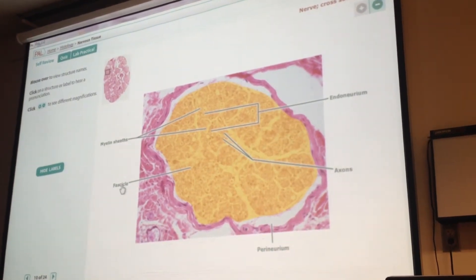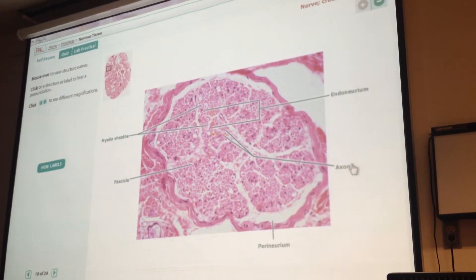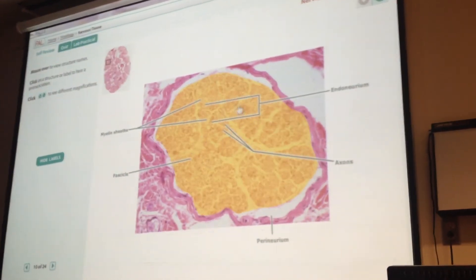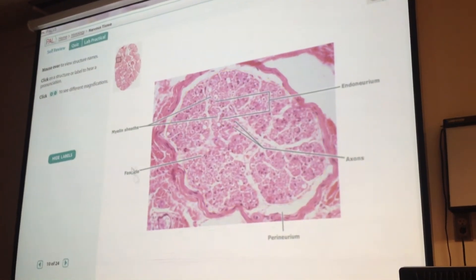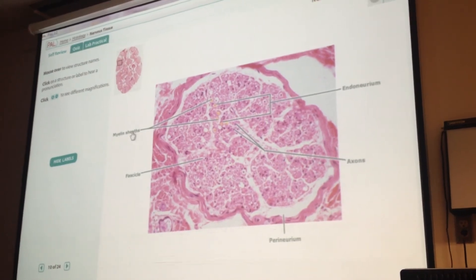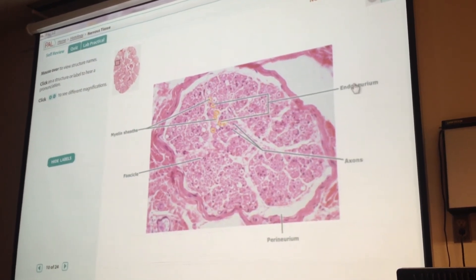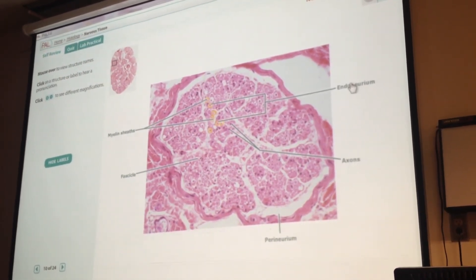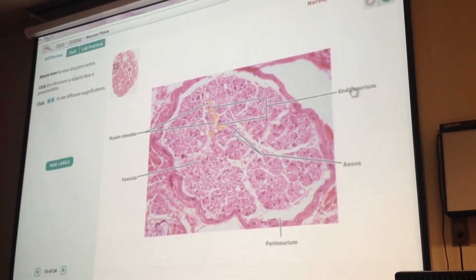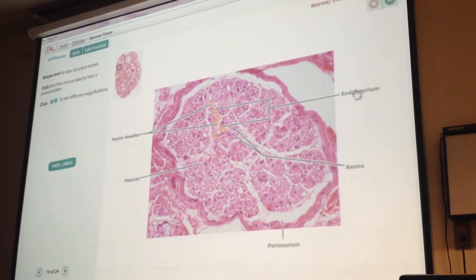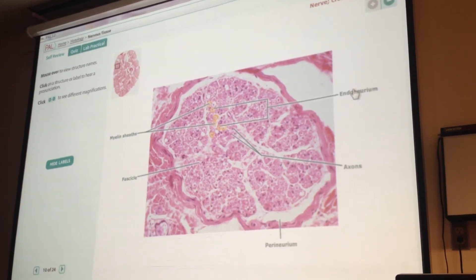Zooming in on one fascicle, you're getting cross-sections of axons. The little dots on the inside are the axons, with the myelin sheath around each axon, and then the endoneurium — not something we're going to see with our microscope — is that connective tissue around the myelin sheath.